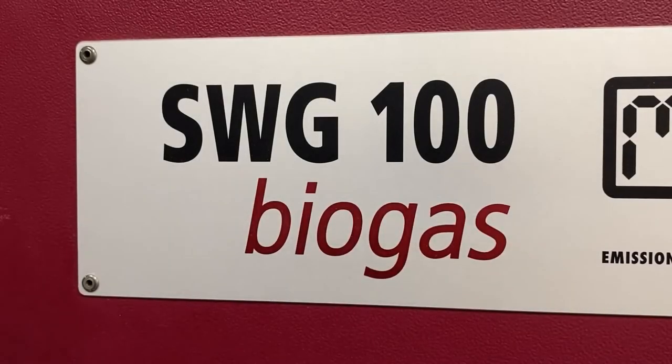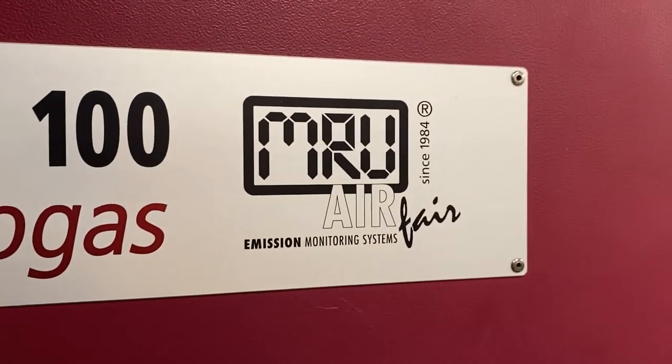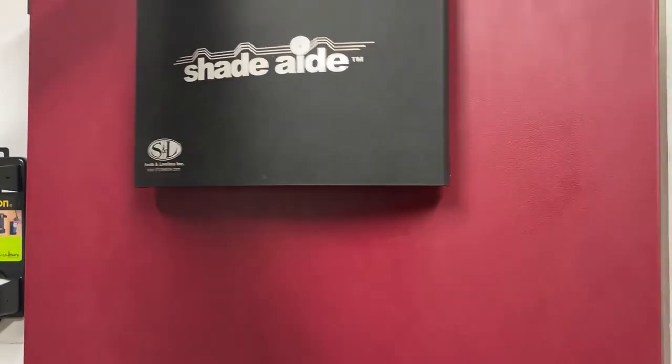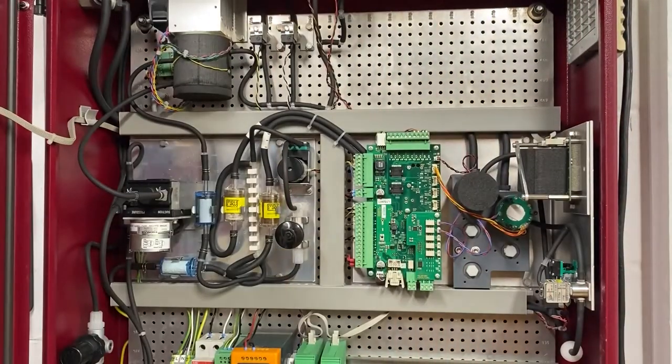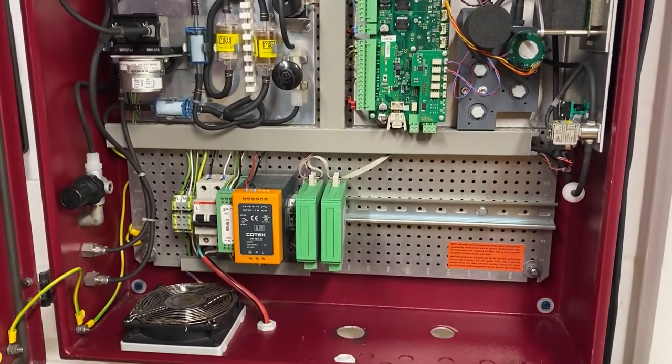The SWG fixed biogas analyzer from MRU. Performing even basic maintenance on this machine can seem like a daunting task if you're not properly trained, so Diamond Scientific is here to help.